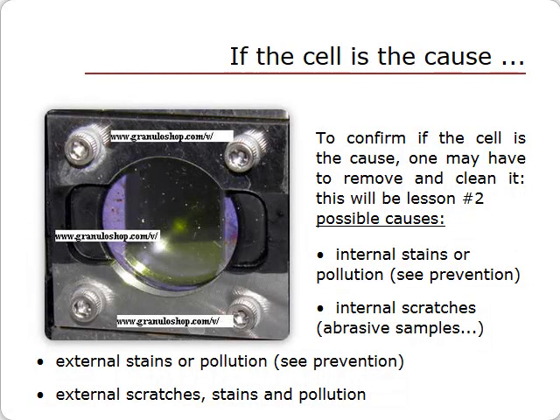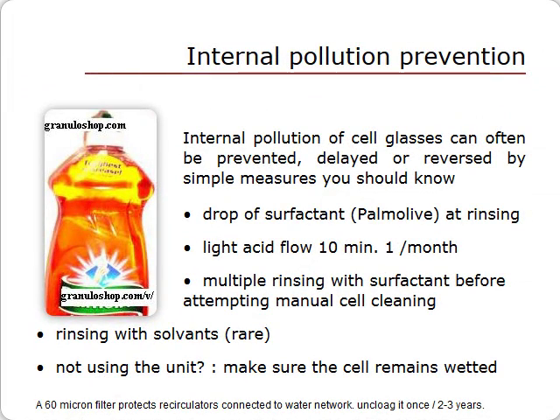If, despite these simple steps, the set zero remains bad, the problem most likely lies with the sample cell. These problems can be of various types, but simple procedures can prevent them. Always rinse after each run. Add just one drop of surfactant during each rinse. If your water is hard, top up with household acid on a regular basis and circulate for a few minutes to dissolve any calcium film deposition on the cell windows. You should also rinse several times with some surfactant before taking action on the cell itself.